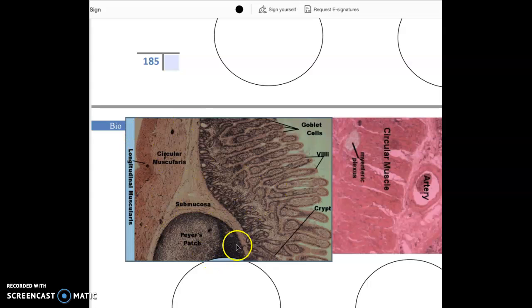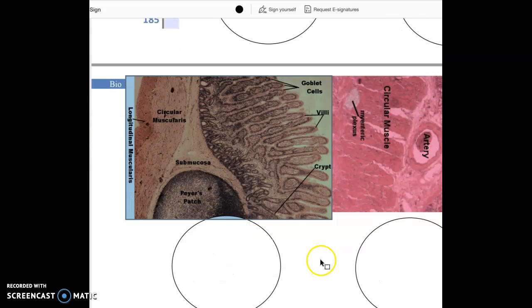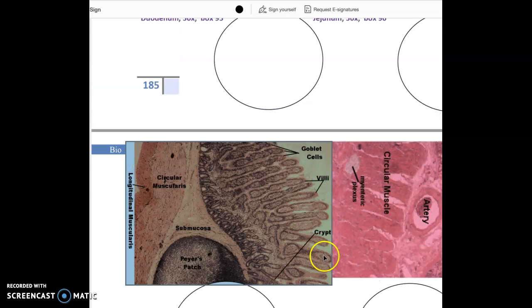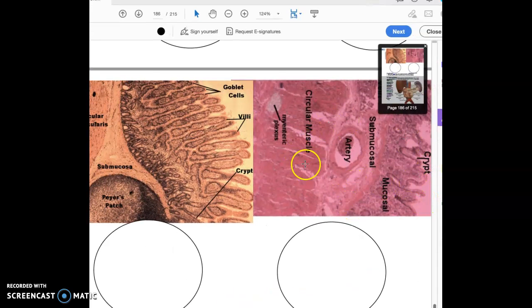So this is that other slide you did called the ileum. So it doesn't have the serosa layer on it. But that's what you're doing on that one. And I just realized, I think this is actually that large intestine slide that you're going to do that somehow kicked out the proper slide. Very interesting.